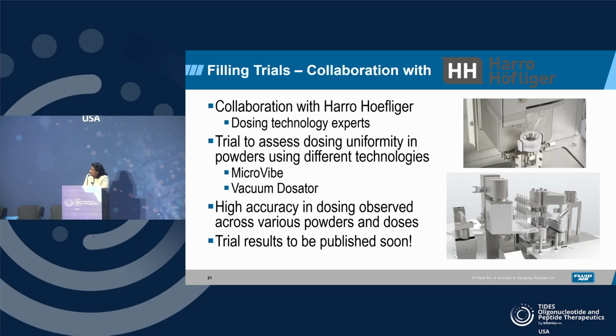There was high accuracy in dosing observed during filling trials for various powders that were generated using electrostatic drying. These results will be published very soon. We just concluded, so unfortunately I could not use the results here. So the results would be published. If any of you is going to attend TIDES in Europe, you will be seeing those results there.